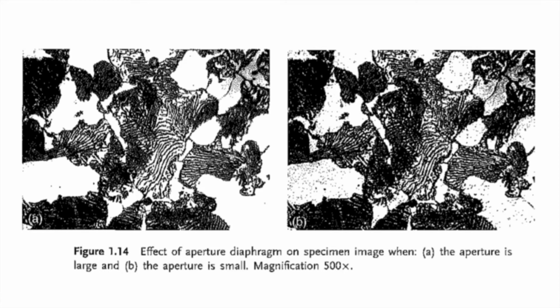And so to me, even though a large aperture will give you better resolution, and a small aperture will give you a larger depth of field, it doesn't necessarily mean that those are the only things to consider, right? So for example, if you look in this region, we see a bit more contrast between these stripe regions, which gets blocked out here because the contrast between the features is less.